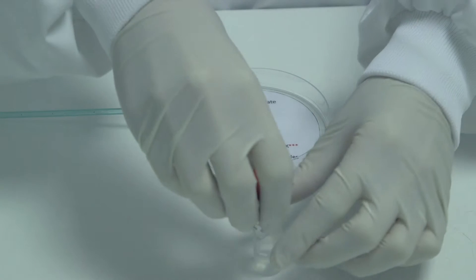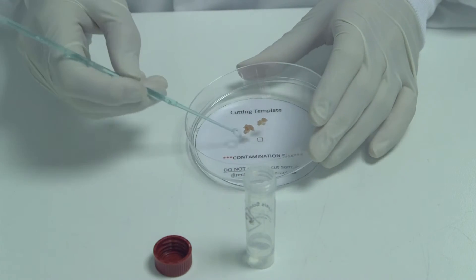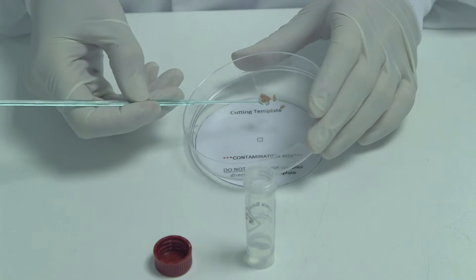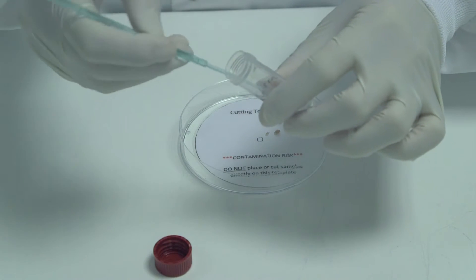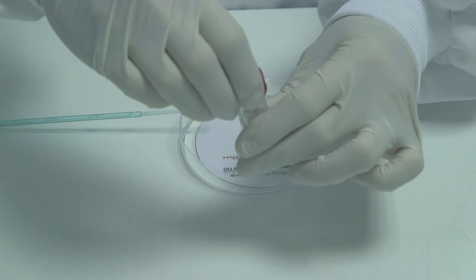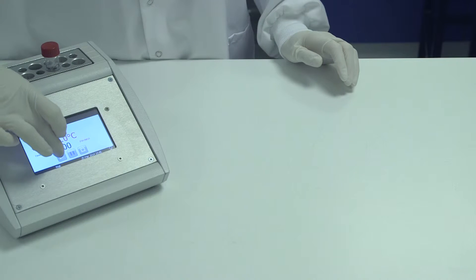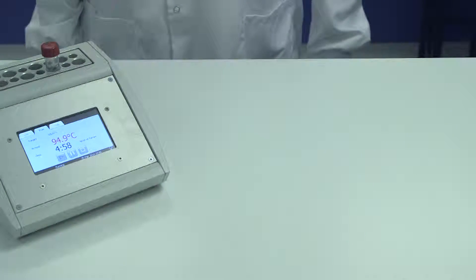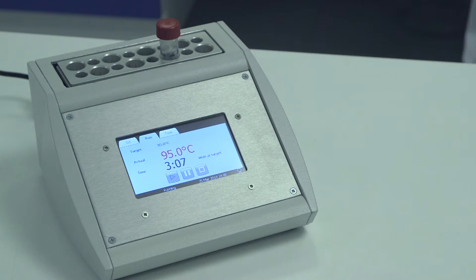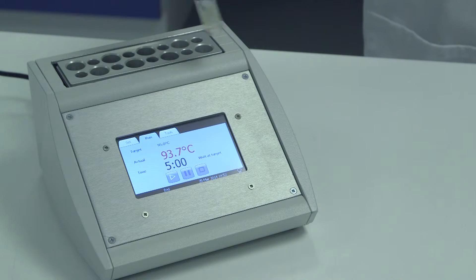Shake and place in the heat block for 5 minutes. Remove from the heat block and allow to cool. While waiting, the reagents can be prepared for the amplification.